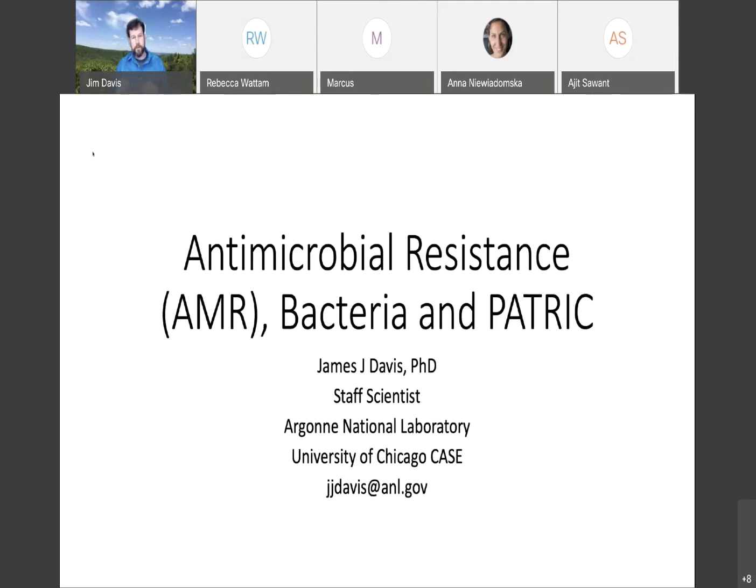Okay, so my name is James Davis, and I'm a staff scientist at Argonne National Laboratory. And today's webinar will be on antimicrobial resistance, which we all commonly refer to as AMR, bacteria, and PATRIC. I'm also joint appointed through the University of Chicago's Consortium for Advanced Science and Engineering, which holds the prime contract for the PATRIC project, which I'll talk about in a little bit.